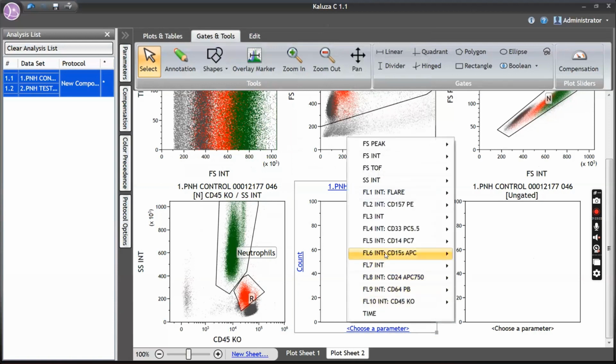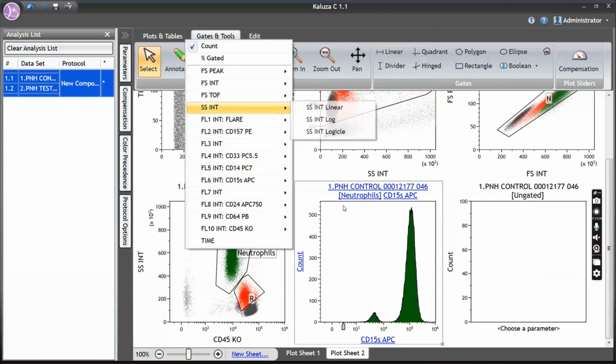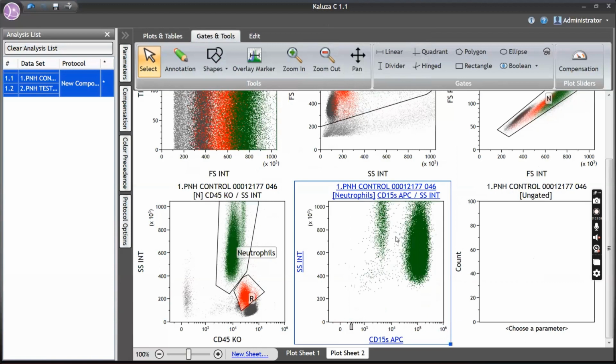Now, neutrophils I need to purify, so I'm using CD15. You see, these are all some eosinophils. Somebody asked me why we are not using CD13. If you use CD13, even eosinophils will come into the neutrophil or granulocyte gate, and that is the reason why I am not using CD13. Similarly, CD16 I can also use, but CD16 is a GPI marker, so I cannot use it as a gating marker. Hence I am using CD15. Now beautifully the eosinophils are separated and only neutrophils are there.